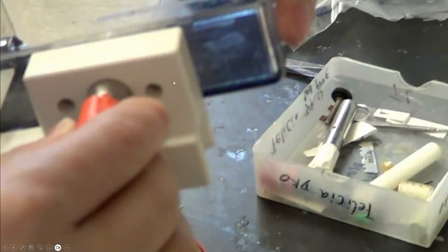And we will insert the cylinder into the compressome on the side, and allow the cylinder to fully enter and penetrate into the water bath, into the collection tray.